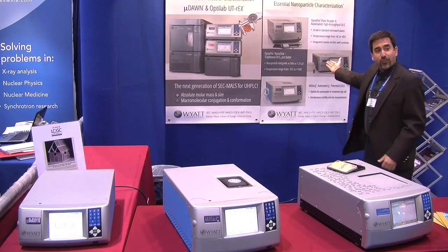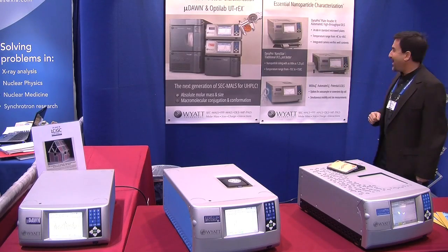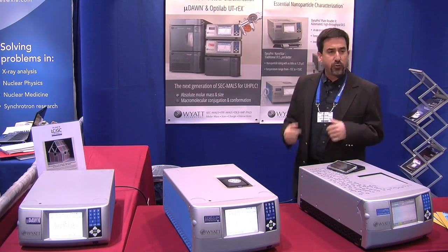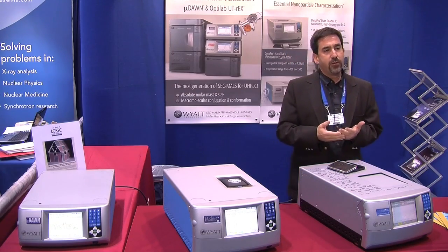We have some other instruments, which you might see here on our posters. For instance, the Nanostar. Nanostar is another dynamic light scattering instrument. It's a traditional cuvette-based dynamic light scattering instrument for measuring size. But one of the unique things about the Nanostar is that it also incorporates a standard static light scattering detector, optimized for static light scattering, and so allows us to measure molar mass as well as the size. And by combining information about size and molar mass, you can learn something about the conformation of the molecules.